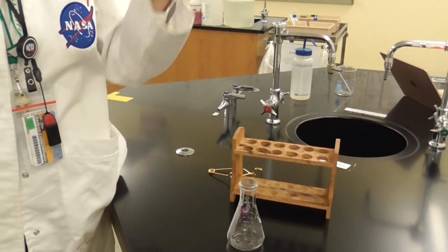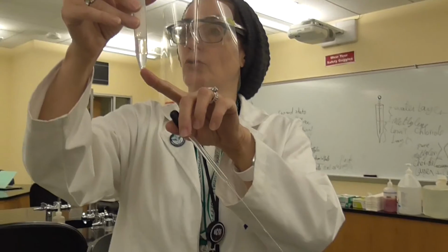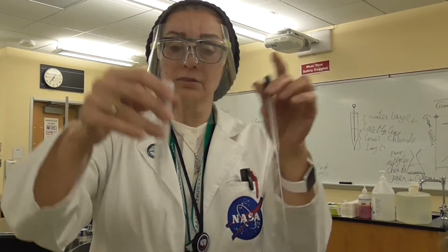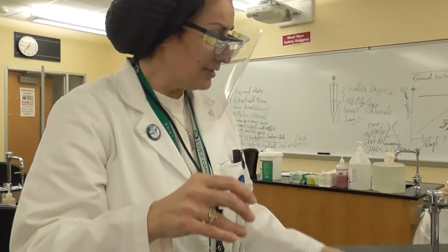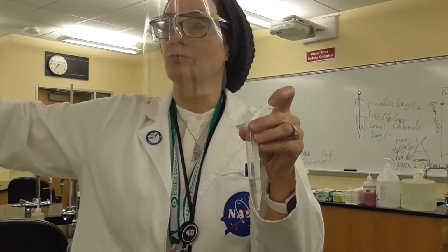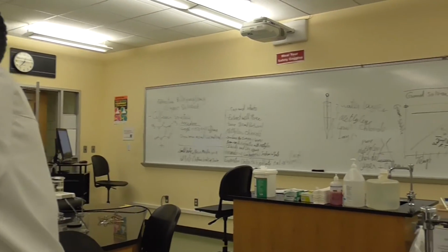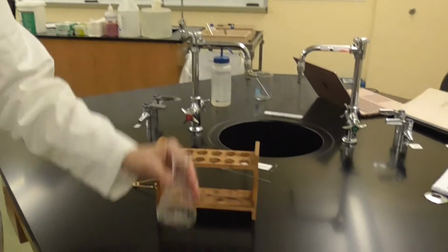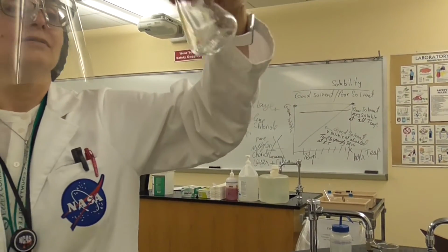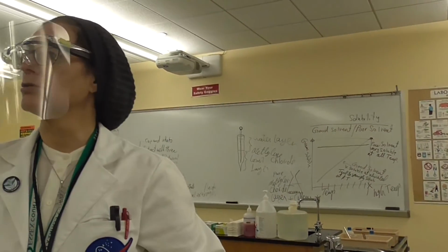Now we're going to add another 2 milliliters of methylene chloride. Although there is some over there, I wouldn't use it, because then I'm going to take a lot of water, and I don't want to do that. So now you are going to add another 2 milliliters of methylene chloride under the hood, and then do the same thing. You can see the chemicals that we extracted here started. Look, it's already evaporating, because of the methylene chloride.